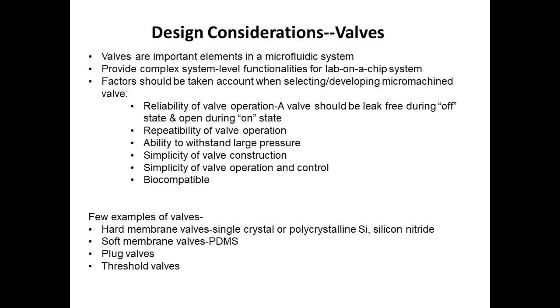There are a few examples of valves that can be used in our application. For instance, hard membrane valves, made from single crystal or polycrystalline material, soft membrane valves made from PDMS, plug valves, and also threshold valves.